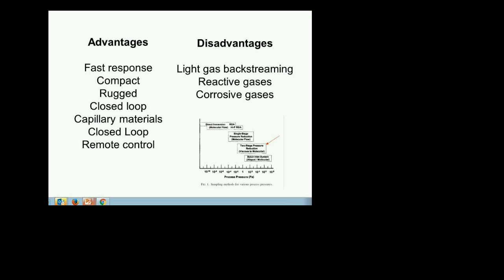I'm looking at it, but I can't read it. It's 8 feet away. Should I go look for the model? You can, but I'll tell you how this goes. There are units that have higher external magnetic field than others.